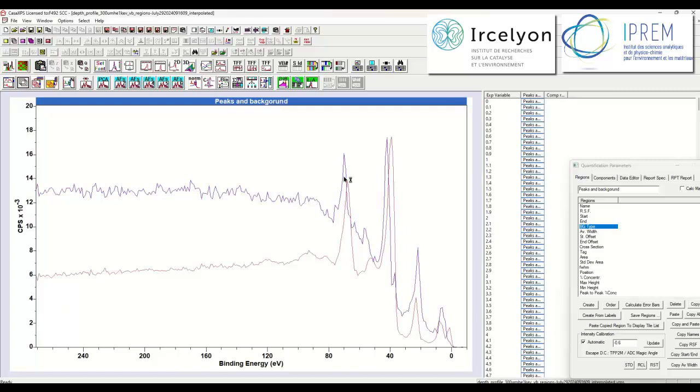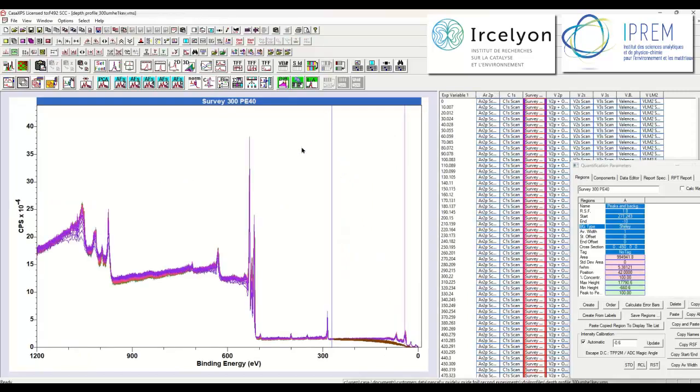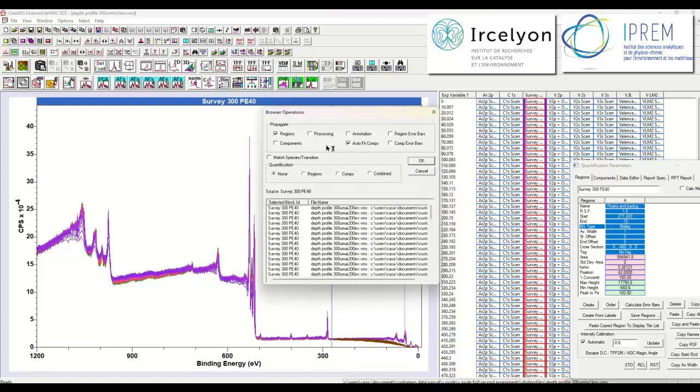I'm using the Control tab to move to the window that displays the survey measurement from the helium experiment, and I've got a region set up as we see here. I will now propagate the region from the active tile that we see in the helium file to all of these survey measurements from the argon.